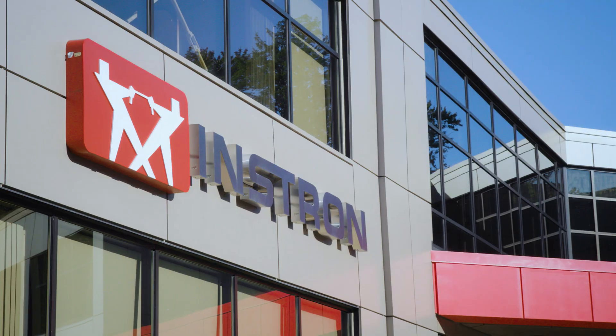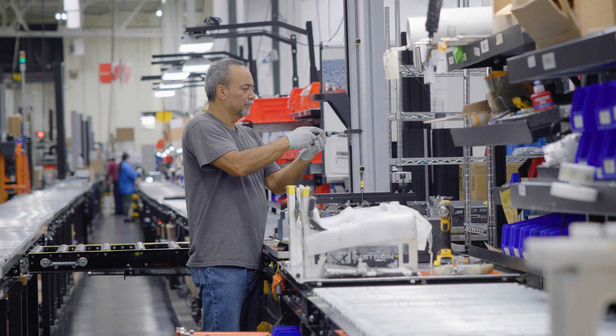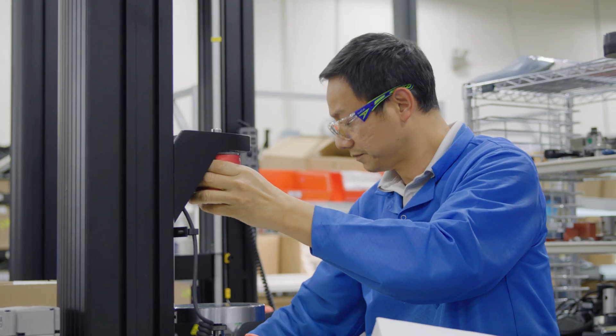Frame components and accessories are machined and shipped daily to Instron's headquarters in Norwood, Massachusetts, where our universal testing systems are meticulously assembled and tested before shipment.